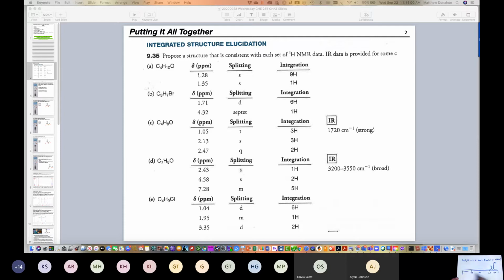And then there's nothing else in the remainder of the spectrum. So basically we count 1, 2. That's two unique sets of H in a ratio of 9 to 1, and what we've synthesized from this data is that the compound is going to be the following.